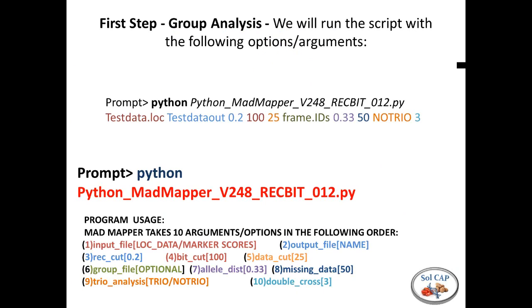For people just using Windows, this looks like a foreign language. But the truth is, if you're going to do high-density genomics and high-density mapping, you're going to have to work outside of a graphical shell for the most part — somebody's going to have to type command lines in a Unix environment. The program can be called up at the website from the previous slide, and at the prompt you just type in these parameters.